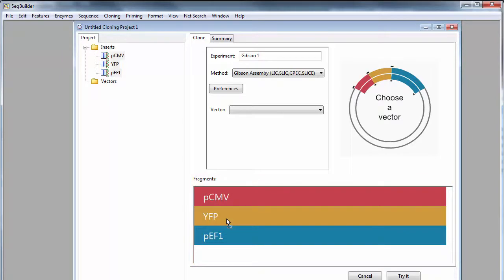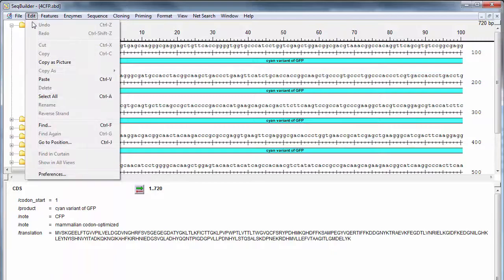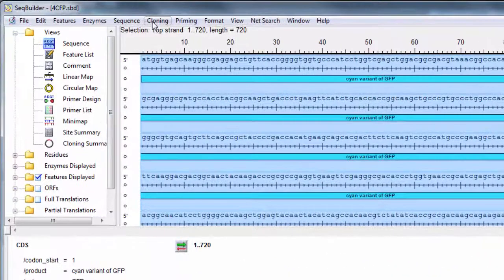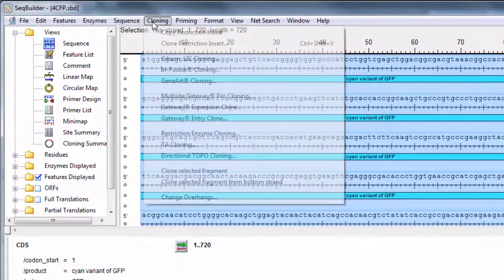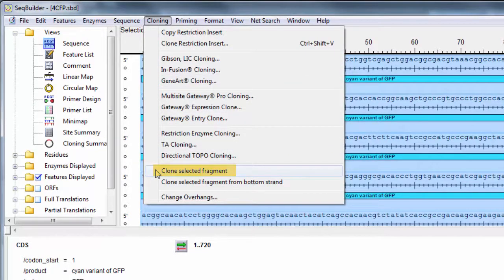Or, if you only want to clone a specific region of your sequence, you can open that sequence, select the area you want to clone, and then choose Cloning, Clone Selected Fragment.